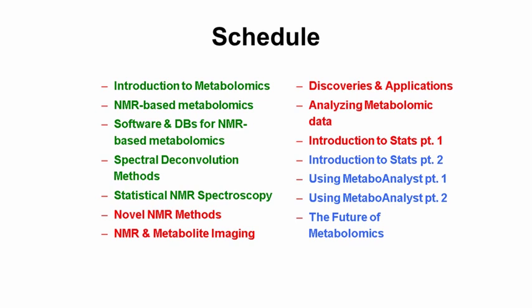So we aren't going to be talking a lot about NMR. In some respects, we've done that for the last 2 days. This is basically how to deal with your NMR data and how to interpret and understand what you're doing. And we'll be using Metaboanalyst as an example. It's not the only resource to do that, but we'll use that as an example.